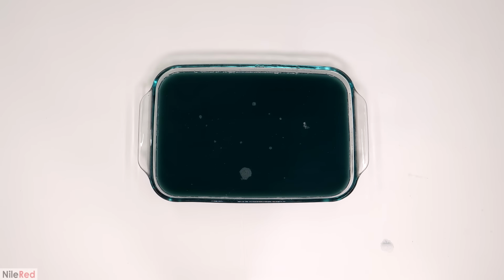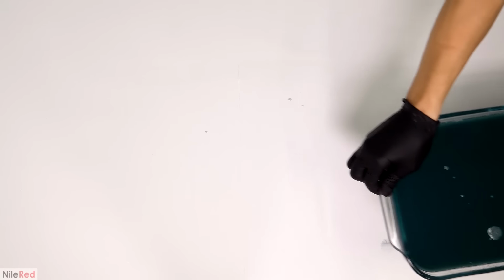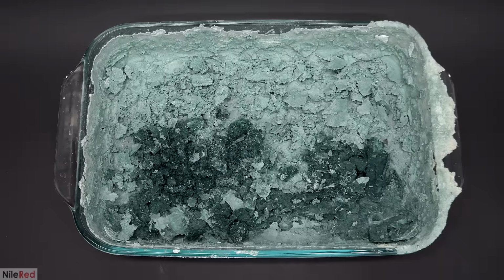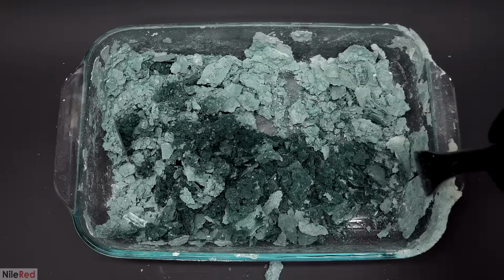What I had here now was probably slightly acidic, but there was so little acid that it really wasn't worth neutralizing. I just directly threw it all into my oven and cranked up the heat. This again dried over the course of a few hours, and then I scraped it off, put it all into a small bag, and that was pretty much it.